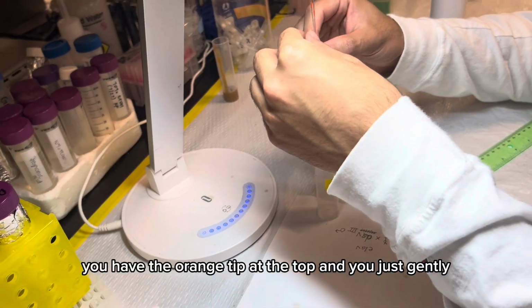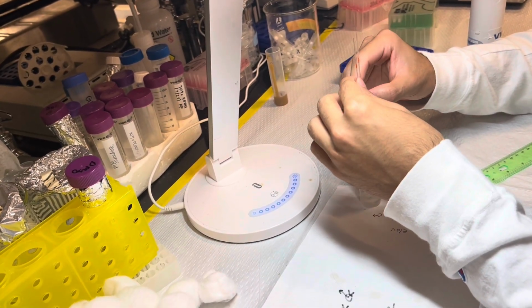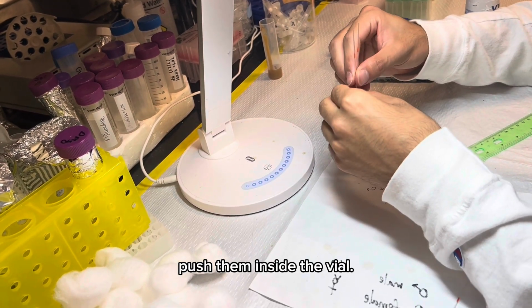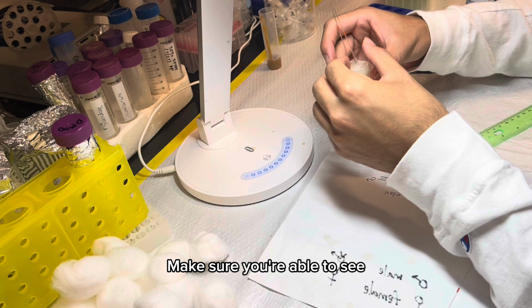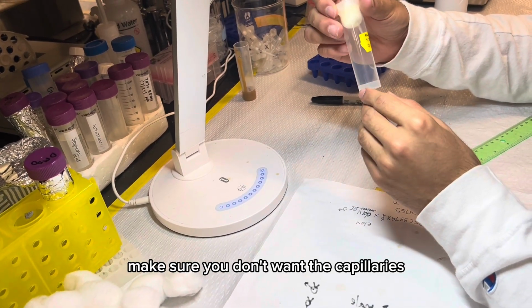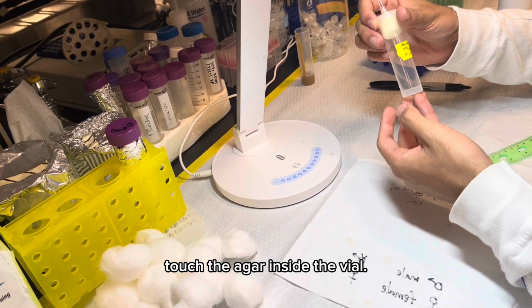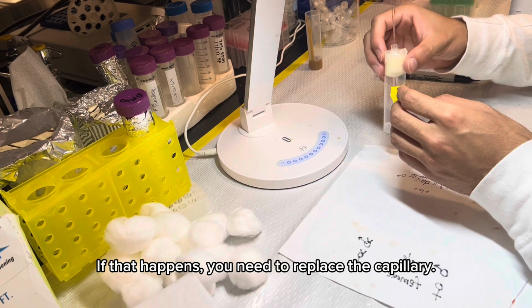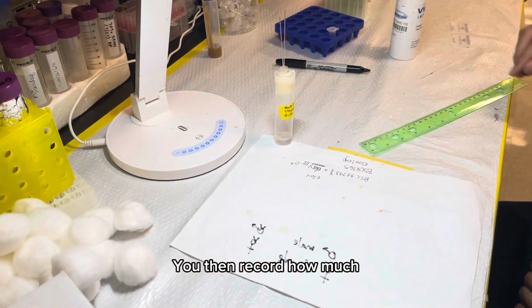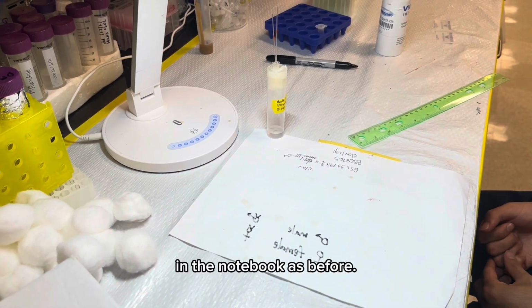You have the orange tip at the top, and you just gently push them inside the vial. Make sure you're able to see the tips of the capillaries inside the vial, and you don't want the capillaries to touch the agar inside the vial. If that happens, you need to replace the capillary. You then record how much of the postbiotic was in each capillary in the notebook, as before.